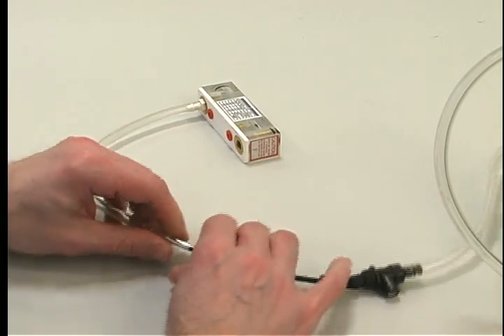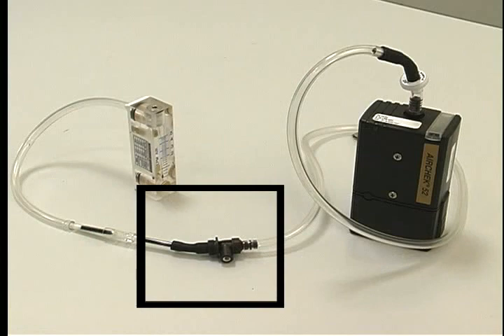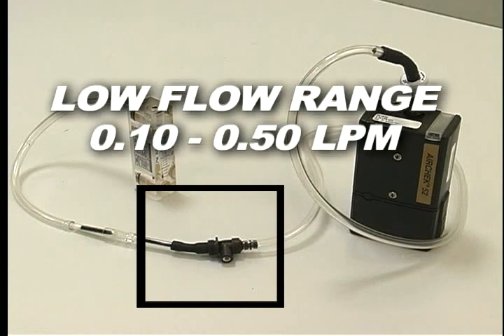Connect the rotometer to the exposed end of the back sorbent tube. This setup uses an adjustable low flow holder. This allows flow adjustments in the low flow range between 0.10 and 0.50 liters per minute.